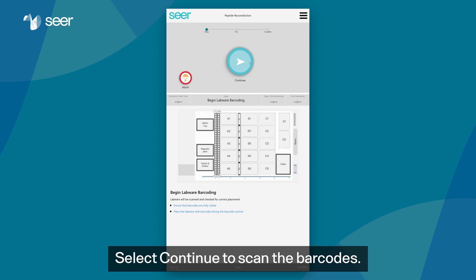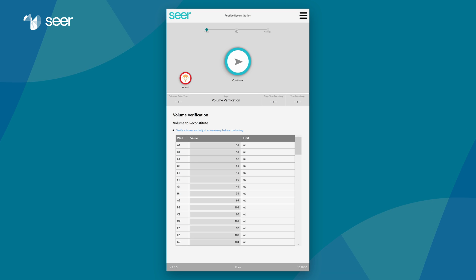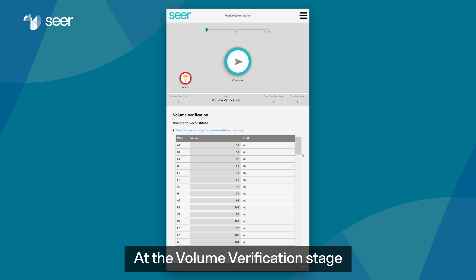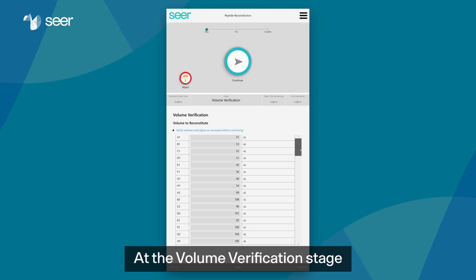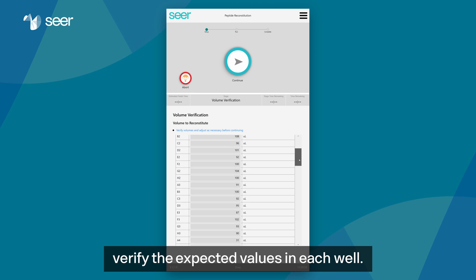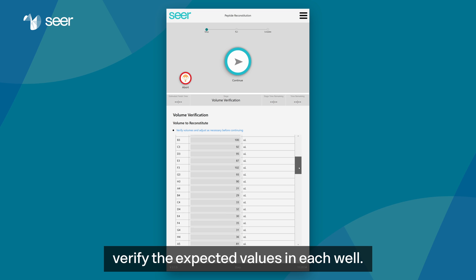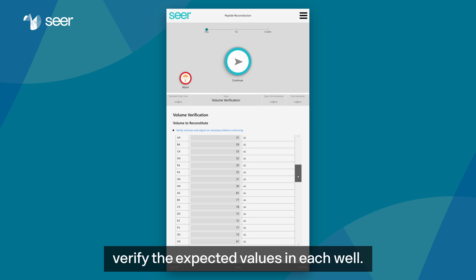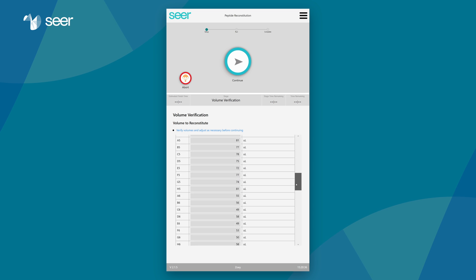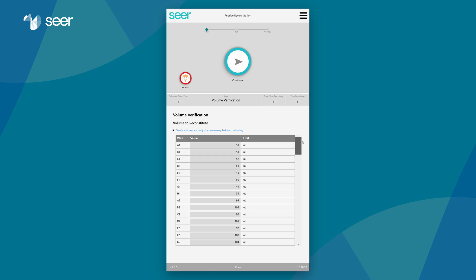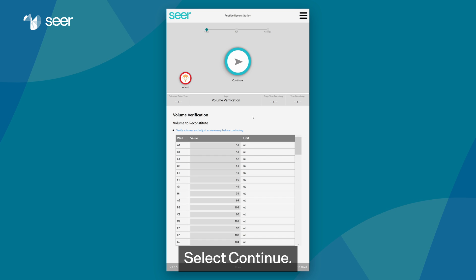Select continue to scan the barcodes. At the volume verification stage, verify the expected values in each well. Select continue.